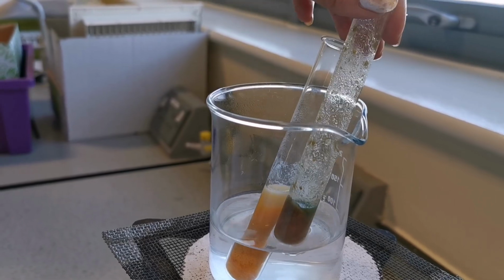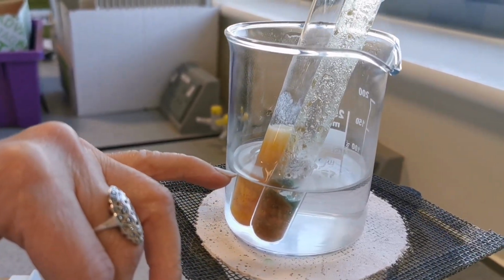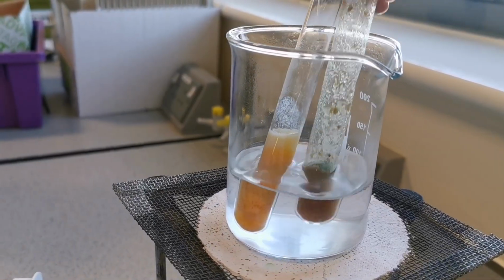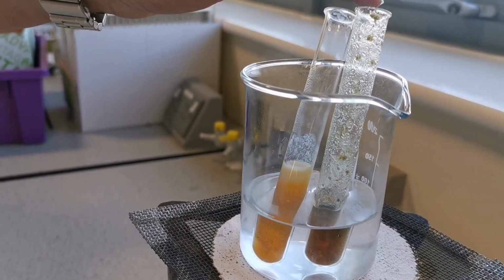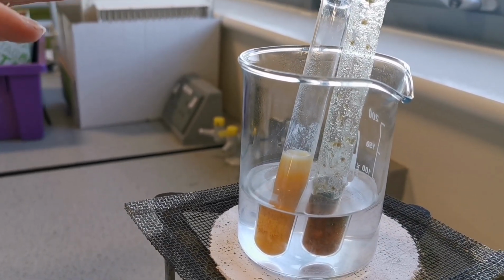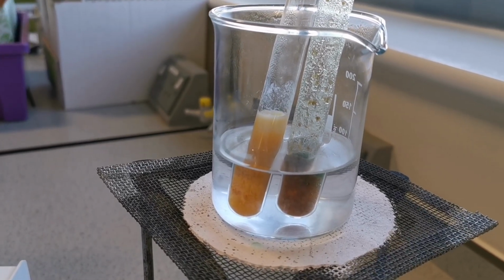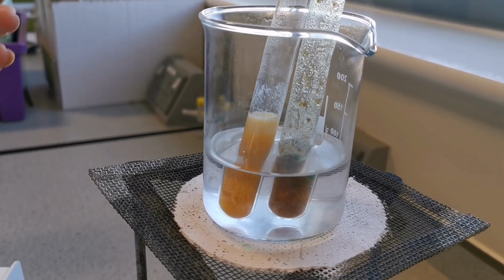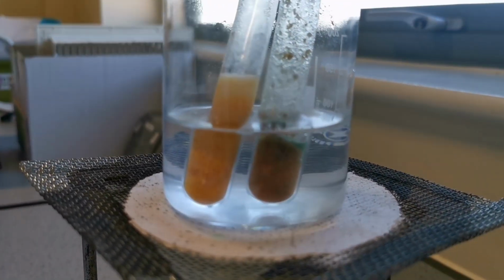So, if we were going to do this experiment again, first of all, I would have put more water in our water bath. Secondly, I would have probably added more Benedict's to this one as well. And also it would be nice to have a look at something that we know is definitely very high in sugars, like sweets or some kind of dessert, to really get a bright red result in the Benedict's.